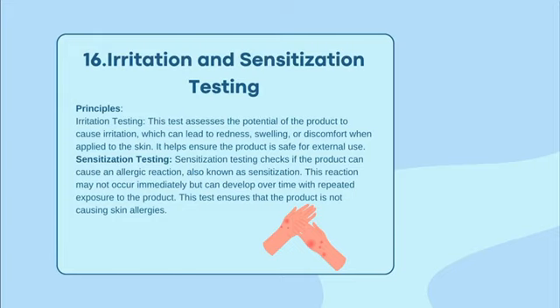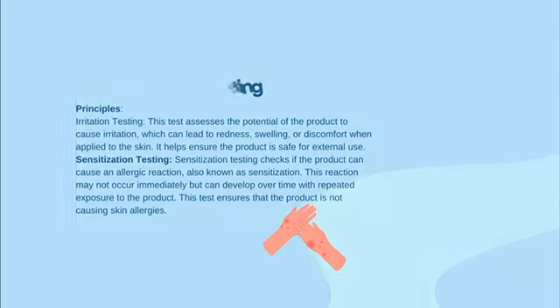Sensitization testing checks if the product can cause an allergic reaction, also known as sensitization. This reaction may not occur immediately, but can develop over time with repeated exposure to the product. This test ensures that the product is not causing skin allergies.